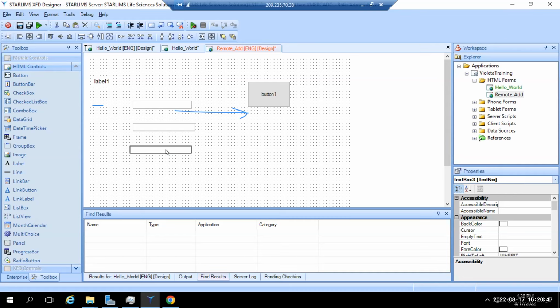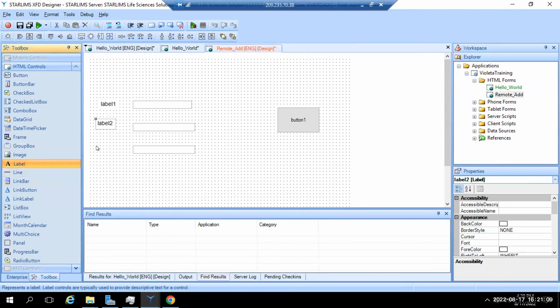By the way, you have all these little things to help you move and align stuff. And the button over there. So then do 2 more labels, right? Label, label, label. Click in and then click again. Don't try dragging them, because it just puts the... there you go.